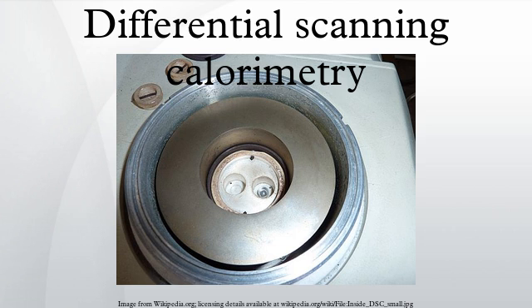The ability to determine transition temperatures and enthalpies makes DSC a valuable tool in producing phase diagrams for various chemical systems. The technique is widely used across a range of applications, both as a routine quality test and as a research tool. The equipment is easy to calibrate, using low melting indium at 156.5985 degrees Celsius for example, and as a rapid and reliable method of thermal analysis.